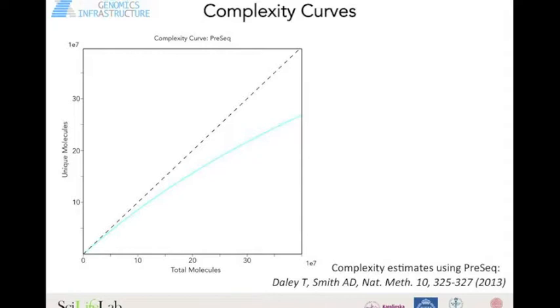So the unique molecules you started with are also the ones you're sequencing. Typically protocols contain PCR, so actually what you're seeing is a lower number of unique molecules. You're sequencing the same unique molecule which you've amplified multiple times. Determining what's a duplicate is in principle very simple, but in practice very hard.